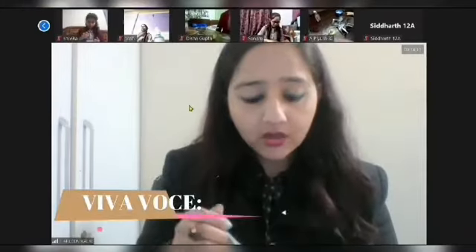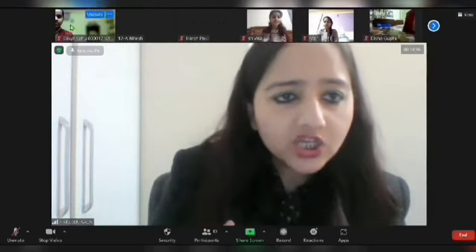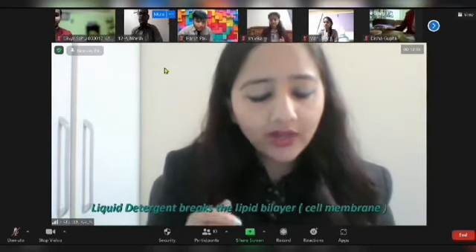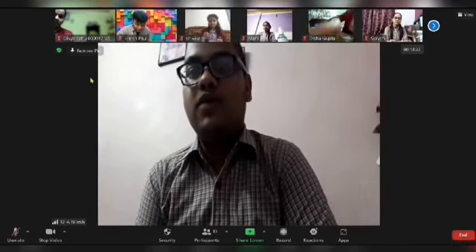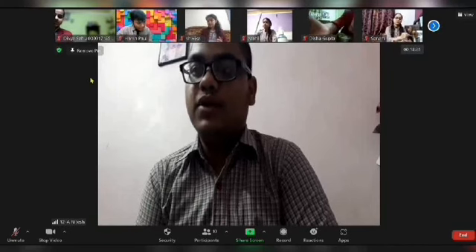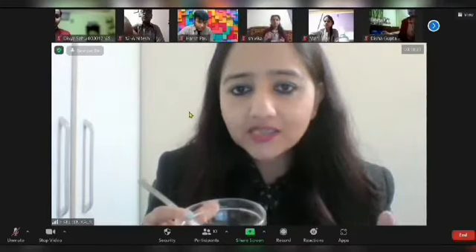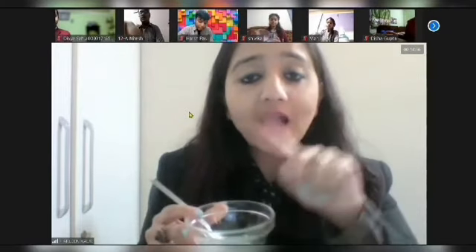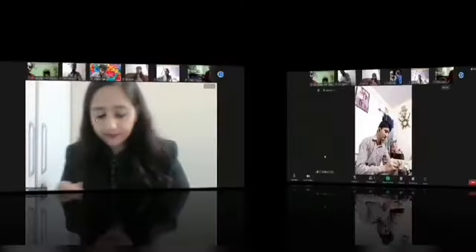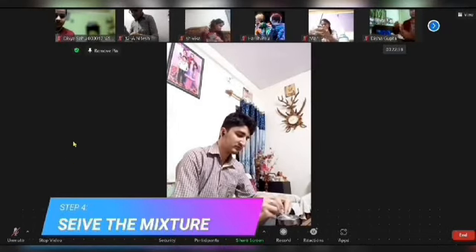So everyone, why we have added the liquid detergent? I think Nitesh wants to answer. Nitesh, would you like to answer why do we add the liquid detergent? To dissolve the plasma membrane, lipids and proteins. Yes. Because basically we want to reach the DNA, and where is DNA present? In the nucleus. So first of all, to reach the nucleus, we have to break the cell membrane. Now sieve the mixture of banana mash and salt detergent slurry.